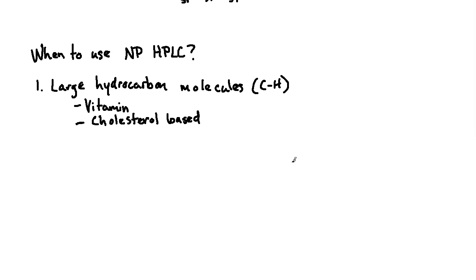Okay, so very often these compounds have poor solubility in polar solvents. So remember, reverse phase uses polar solvents, right? And so it can be next to impossible to load these compounds, and even if you're lucky enough to load them, moving these large hydrophobic compounds along something like a C18 column might be incredibly difficult, okay?